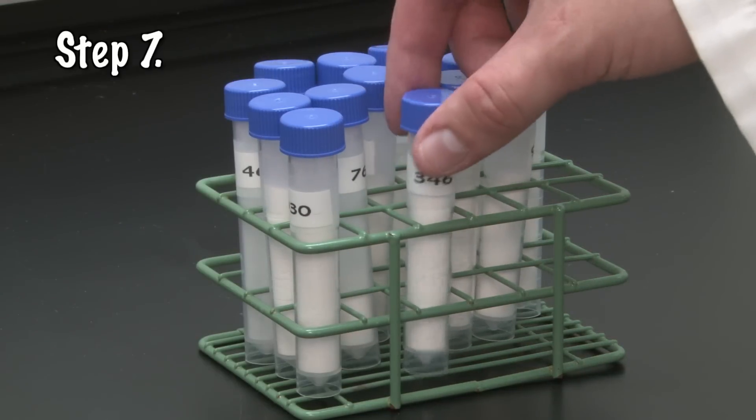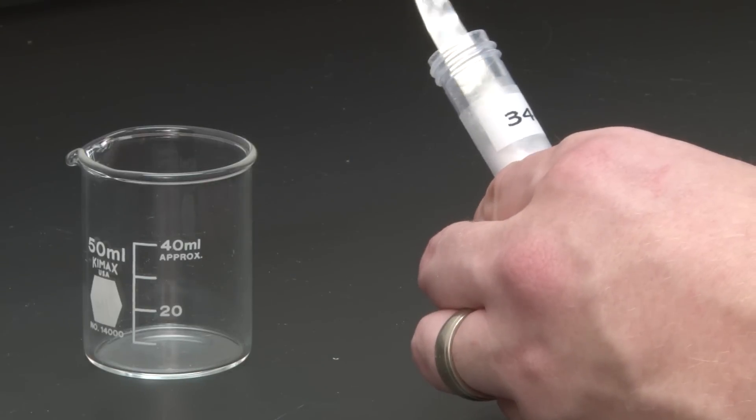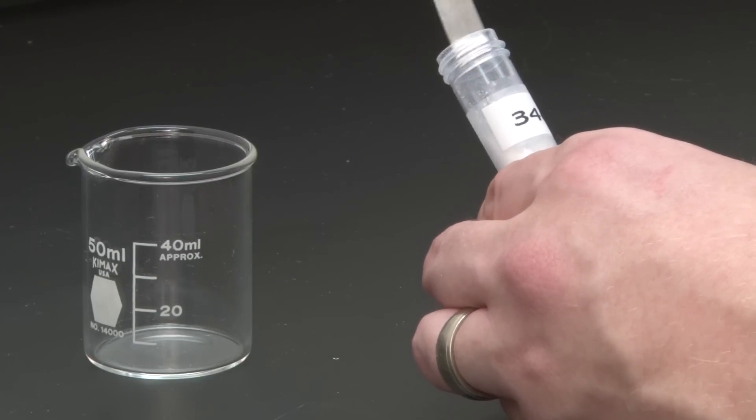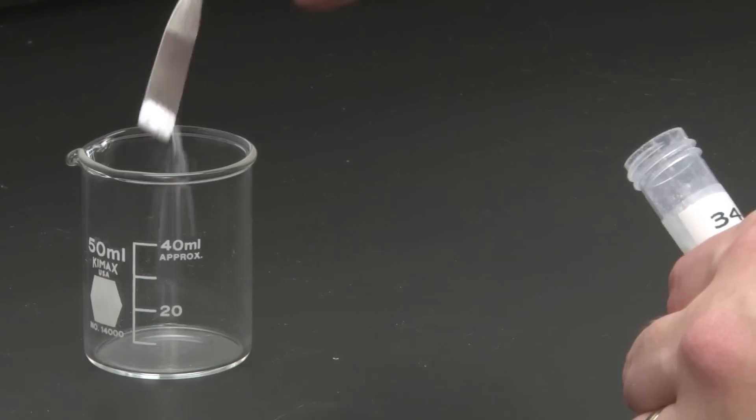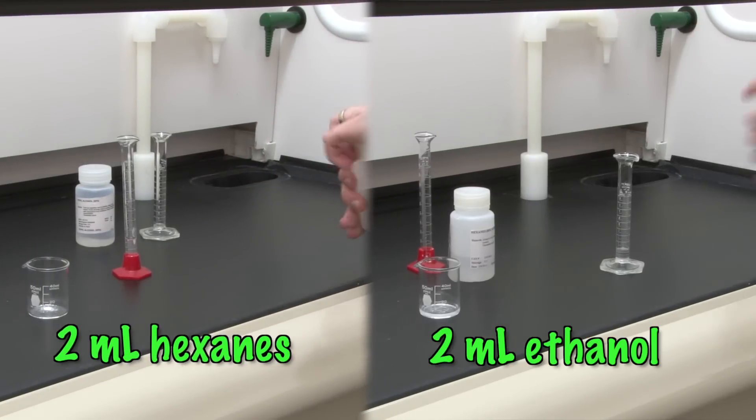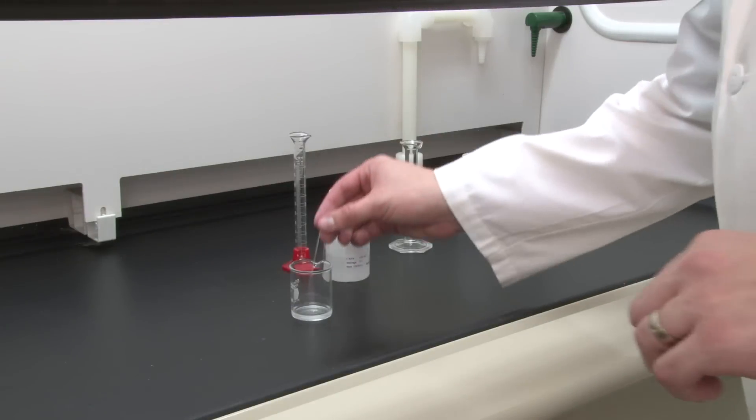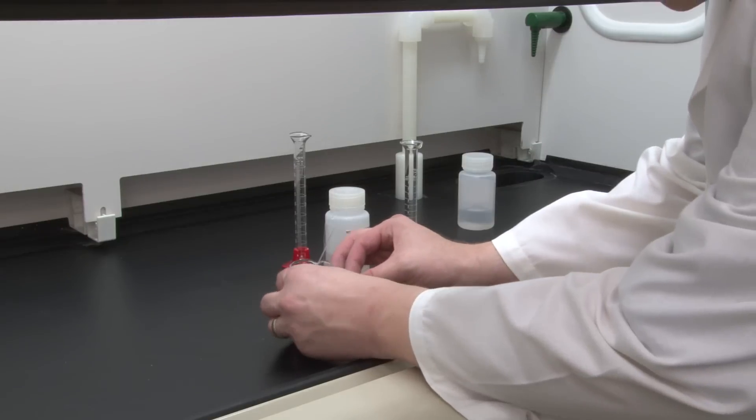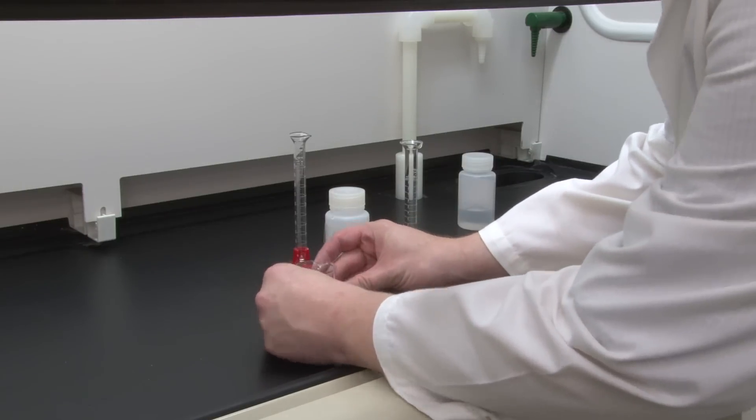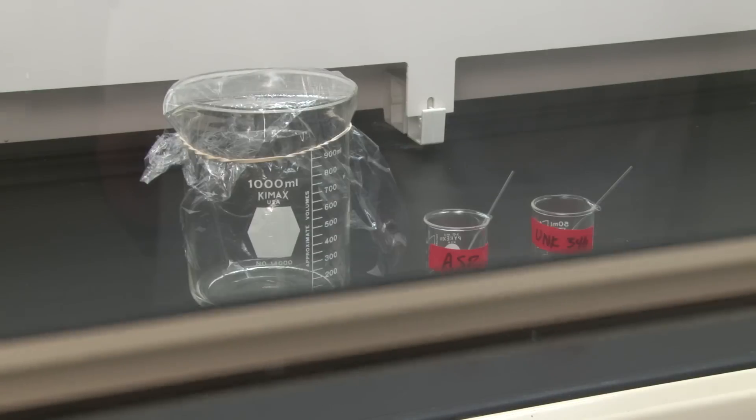Now, get an unknown sample from your instructor. Be sure to write down the unknown's number. Prepare it in the same way you prepared the known sample. Place a small amount in a separate 50-milliliter beaker and add ethanol and hexane under the hood. Stir, label the beaker, and add a capillary tube. Return the remainder of the powdered unknown to your instructor. At this point, you should have your developing chamber, a dissolved known sample, and a dissolved unknown sample.